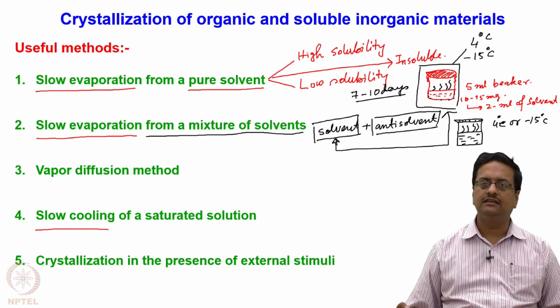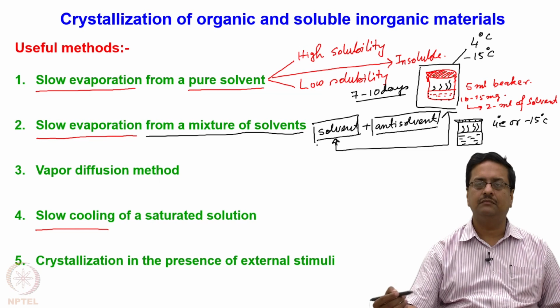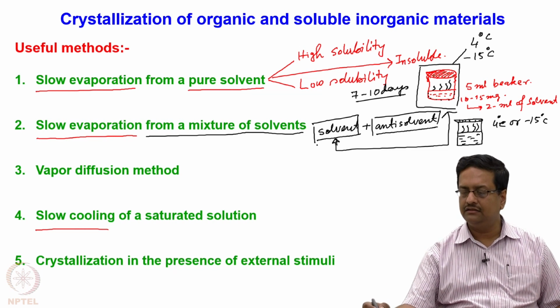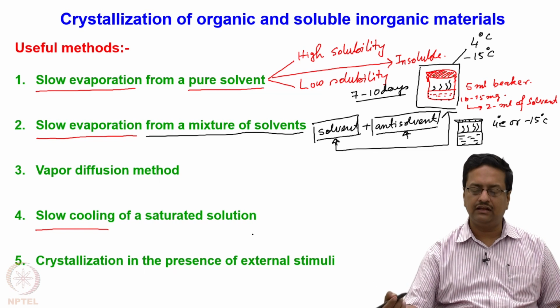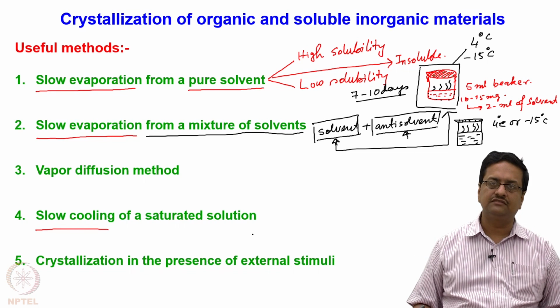Under that condition, when the solvent is much less in amount and your solute cannot stay in the solvent, it starts to grow its crystals. There may be some anti-solvent still left over, in which those crystals will be floating, and it will be easy to collect those crystals from this particular solvent mixture.